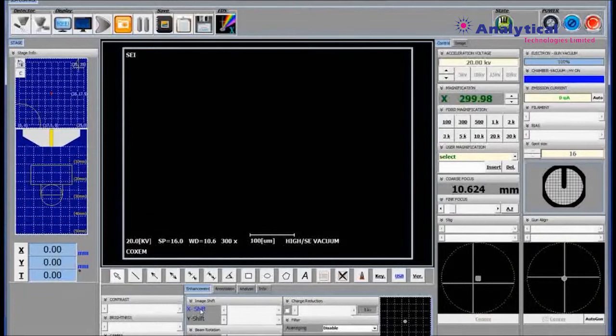There is movement in the X, Y, and R direction. This is not a stage movement. It is a change in the direction of the beam to control the X, Y, and R. But there lies a limitation in that it is beam movement rather than stage movement.